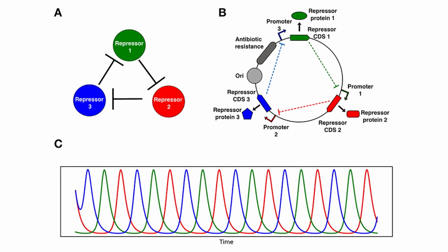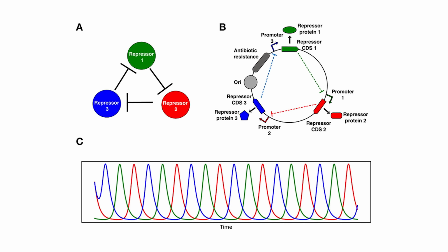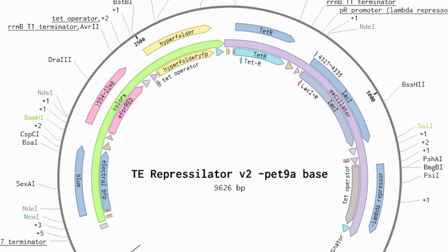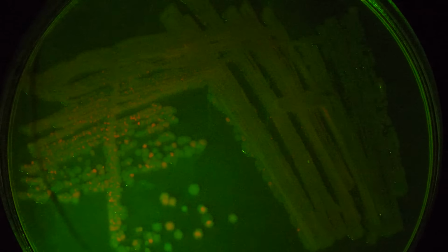This oscillating construct is called the repressilator and was originally published in 2000 by Michael Elowitz and Stanislas Leibler, as an example of an artificial circadian rhythm circuit. My homebrew version of the construct was designed to make it as easy to use and modify as possible, and hopefully look good on camera, so let's see how we did. Right off the bat, we see that different colonies are different colors, which is exactly what we want to see.